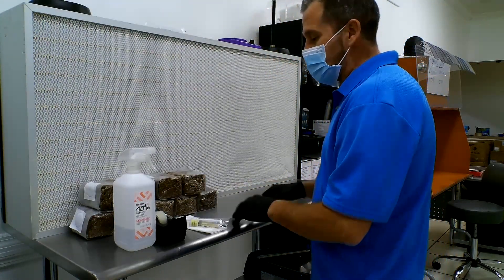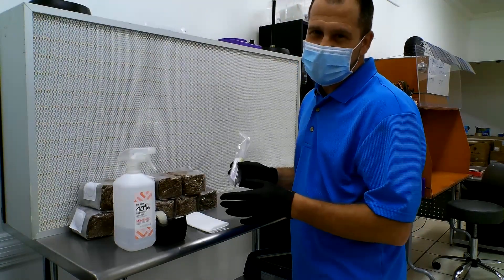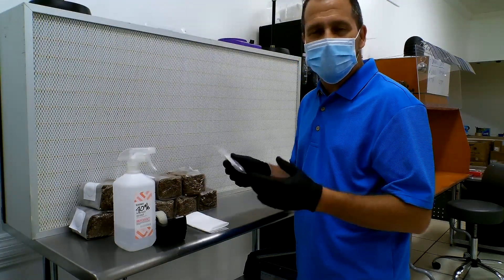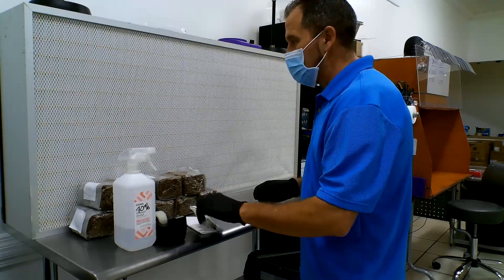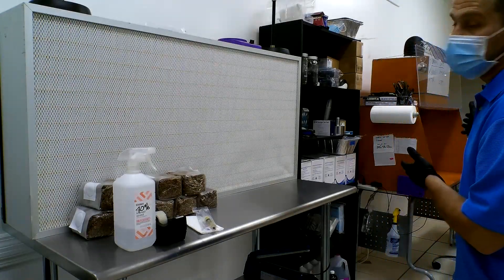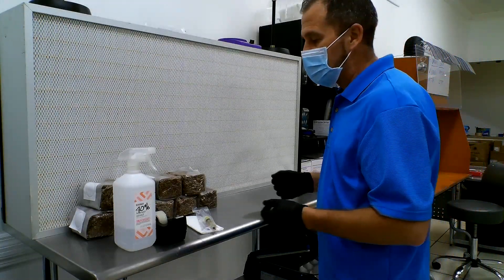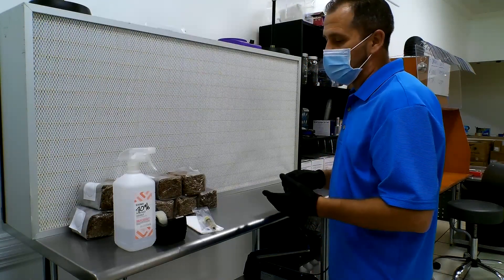With one syringe you should be able to inoculate 9 to 10 rye berry bags — I usually do 9 so I put a little bit more in each one. As you can see, I'm working in a horizontal flow hood here. We also have a vertical flow hood but today I'll be using the horizontal; it's easier for me to stand at and we'll quickly get through the rye berries.